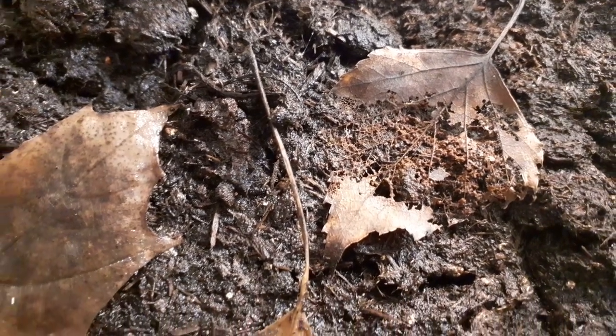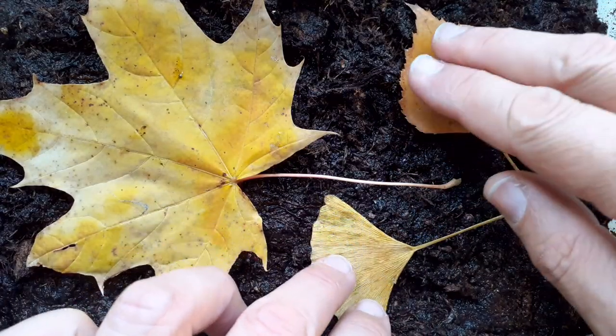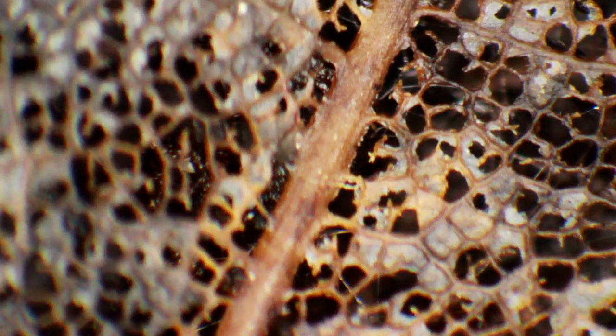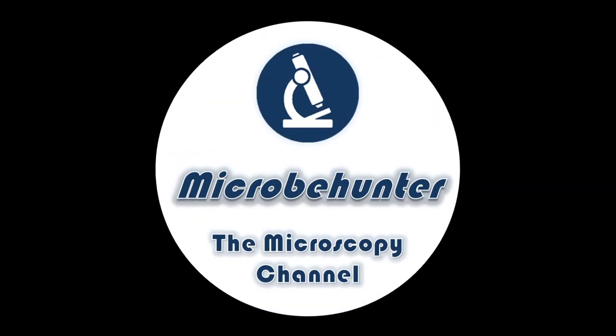After just a few weeks, look at how they look. I'm going to show you how you can do this at home, because I think decomposing leaves are not only an interesting project for students, but also for other folks who want to put something under the microscope. Hi, Microbe Hunter here. I'm going to put this leaf under the microscope, decompose it, and watch the decomposition process over the next couple of days.